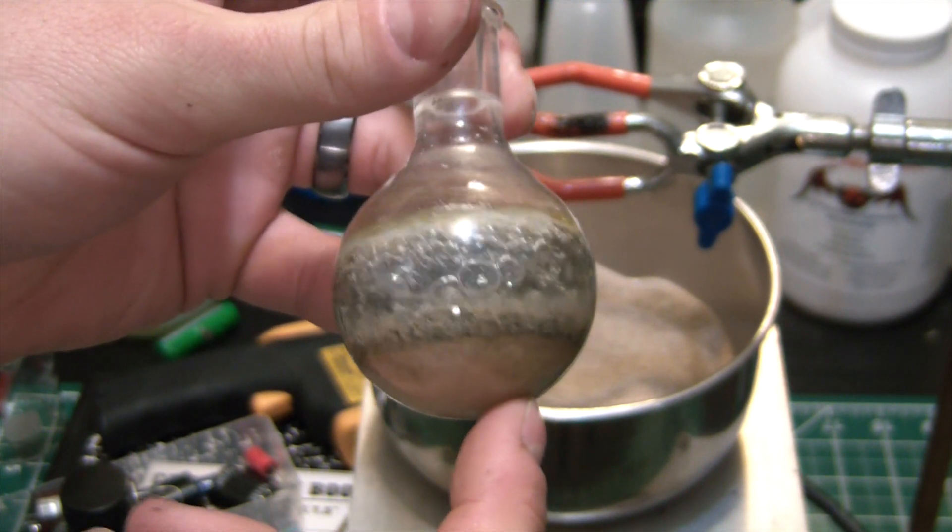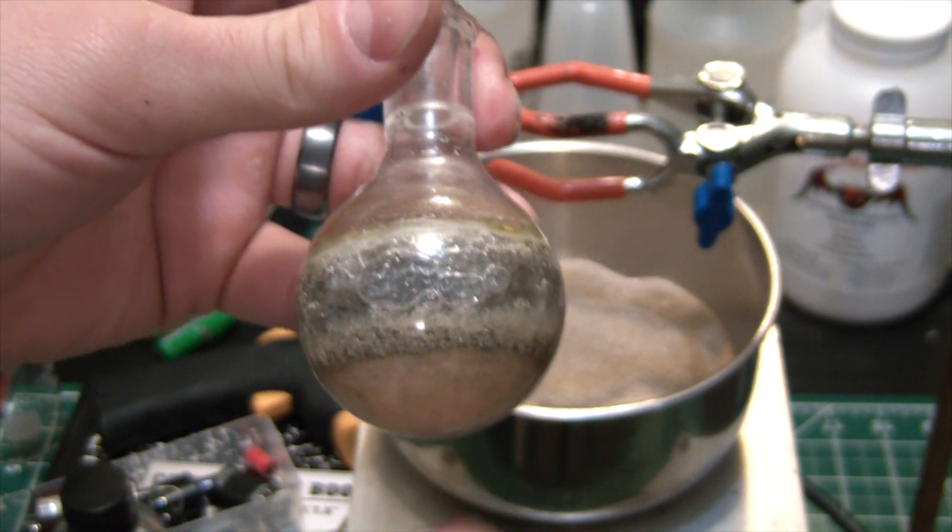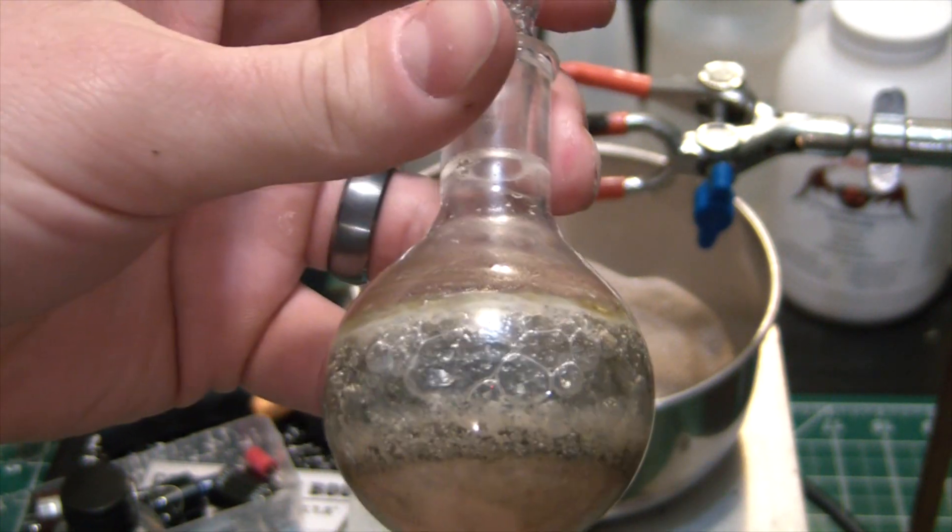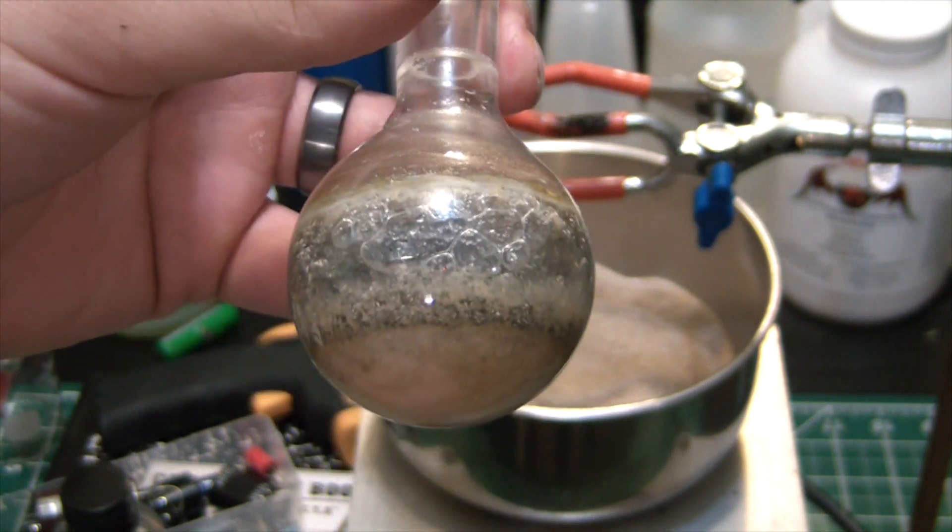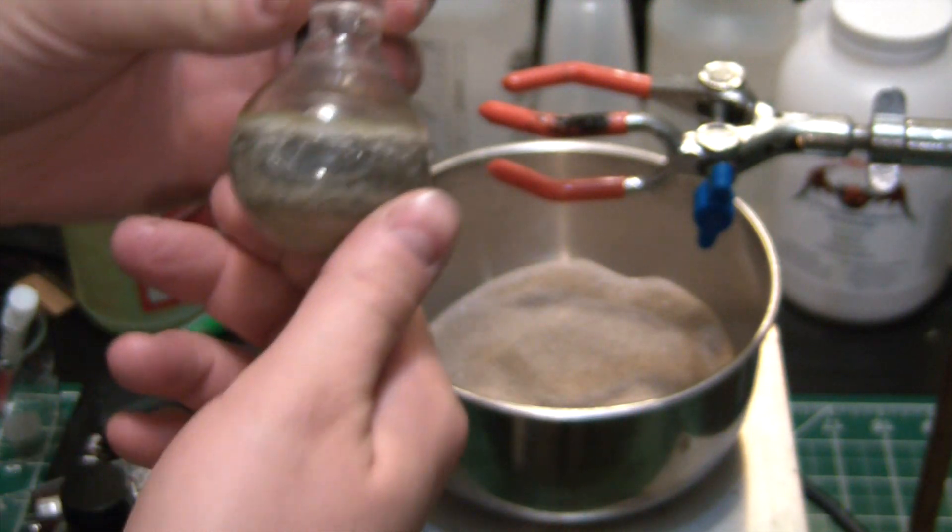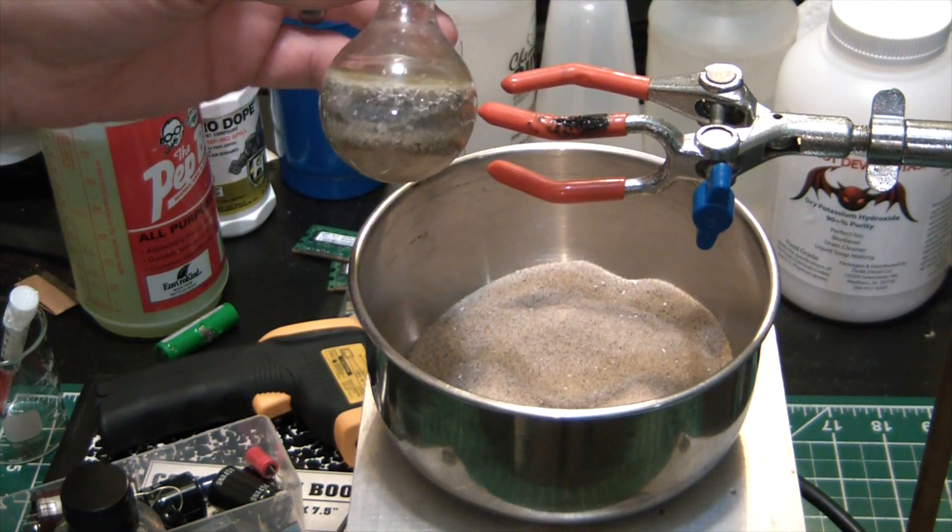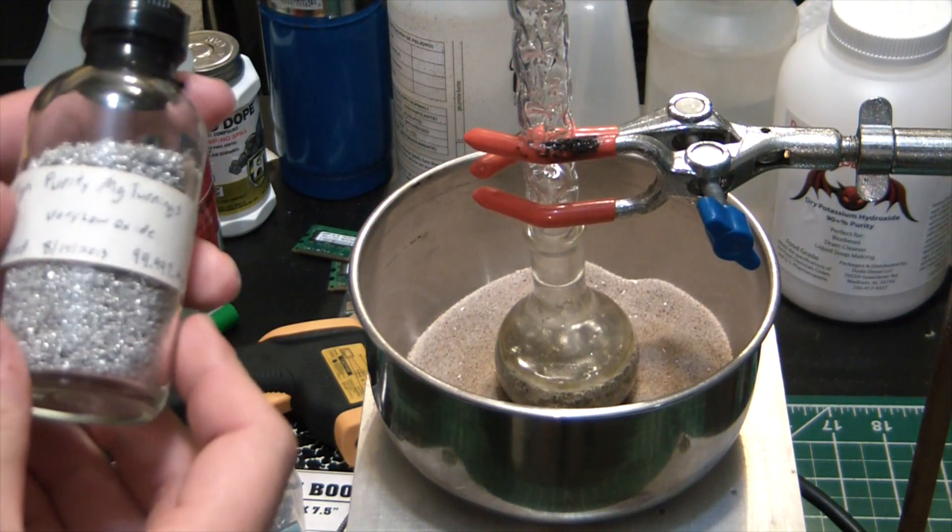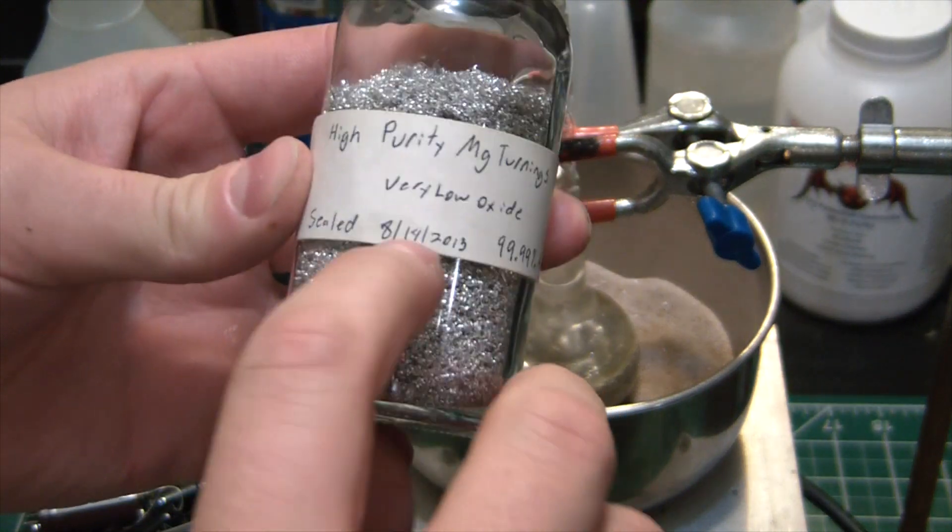Maybe what might be a better idea is mixing the magnesium turnings or chips and the potassium hydroxide before putting them into the reaction vessel and seeing how that goes. Now the other possible issue is the magnesium turnings, you can see.